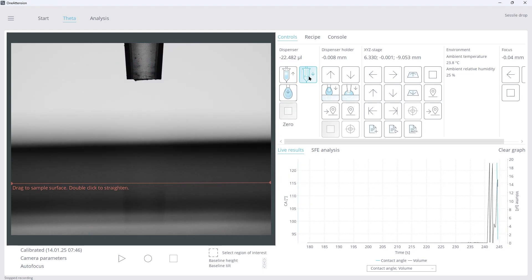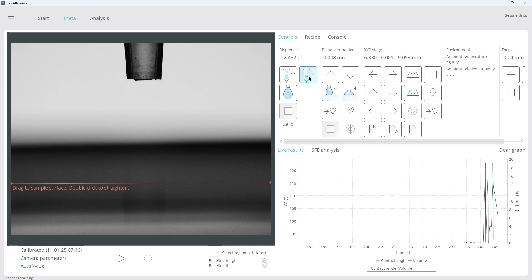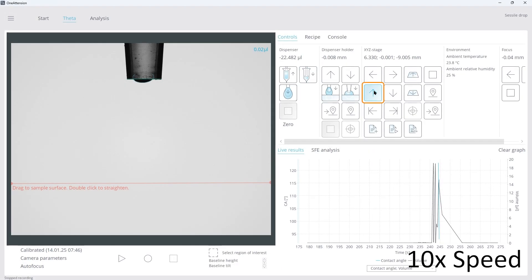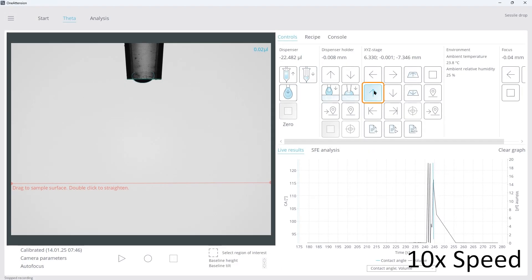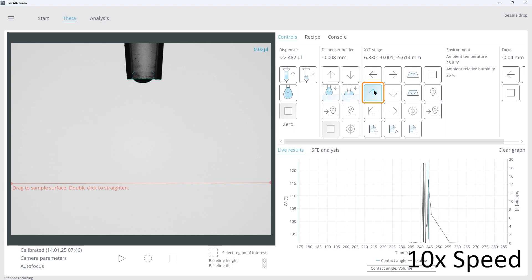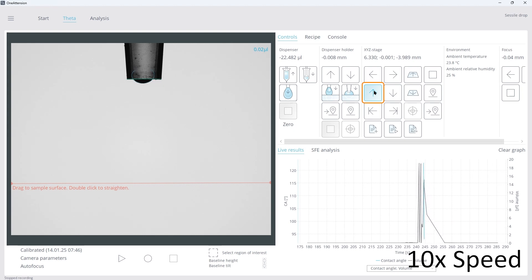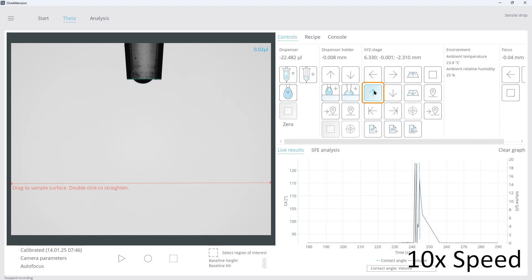Remove your sample vessel and place your sample surface onto the stage. Use the up arrow to move the stage with your sample surface to meet the dispenser.